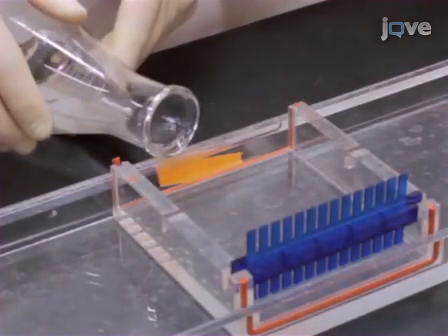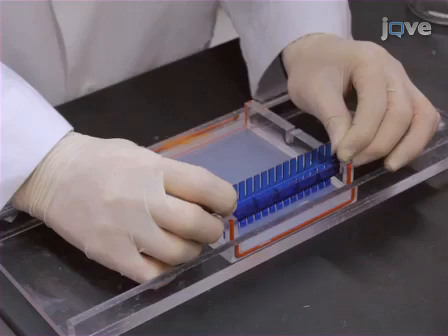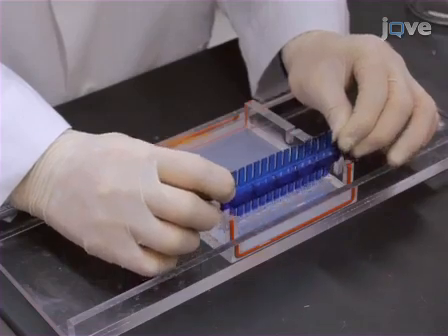Pour the molten agarose into the gel mold. Allow the agarose to set at room temperature. Once the agarose is set, remove the comb.